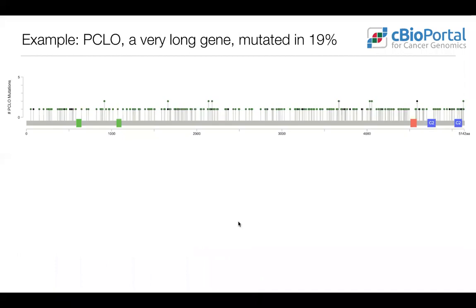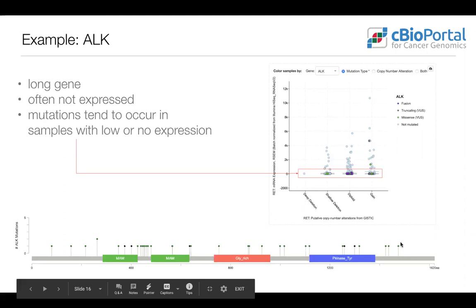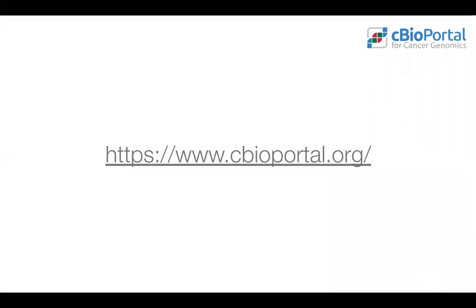A lot of these presumed passenger mutations occur in very long genes. For example, PCLO is longer than 5,000 amino acids and just randomly accumulates many mutations. KRAS, by contrast, is only a few hundred amino acids long with much less potential for random mutations. Another example is ALK — known for gene fusions in lung cancer, but also randomly mutated across its amino acid sequence. ALK is relatively long, often not expressed in lung cancer, and therefore accumulates mutations because there's no negative selection and no transcription-coupled repair since the gene is not expressed.